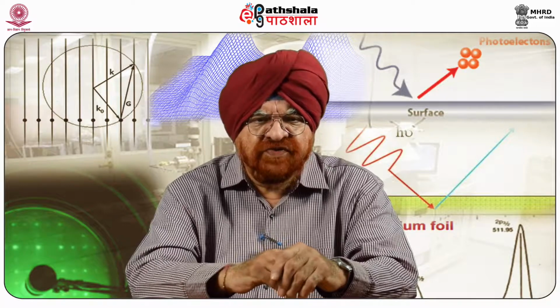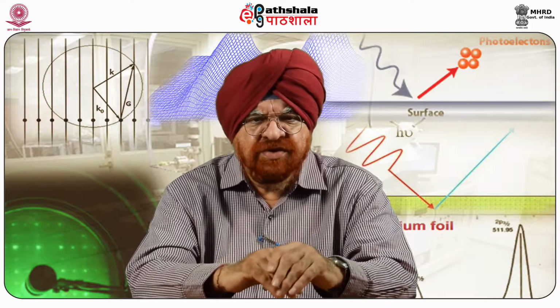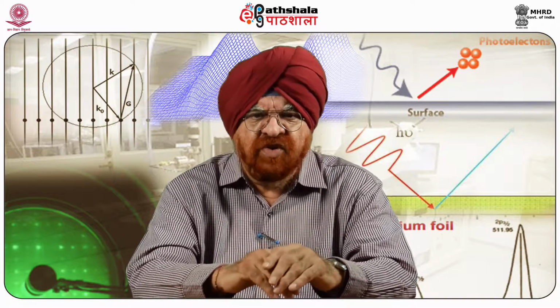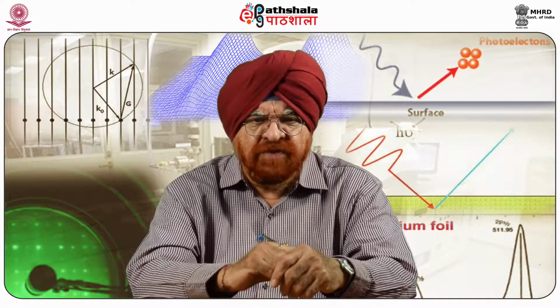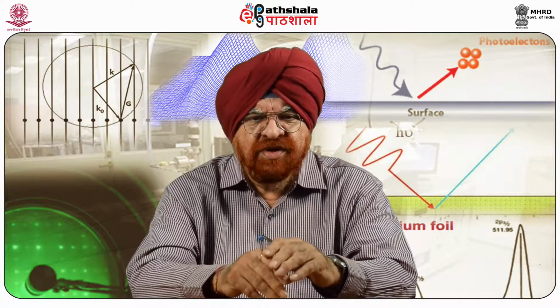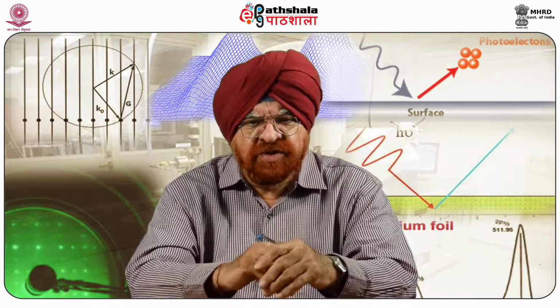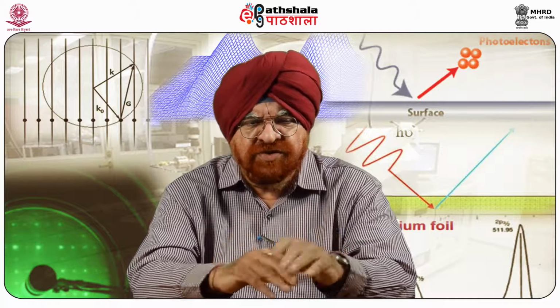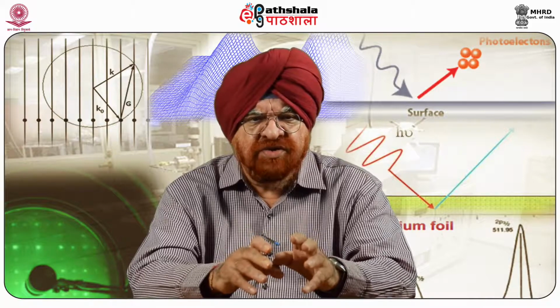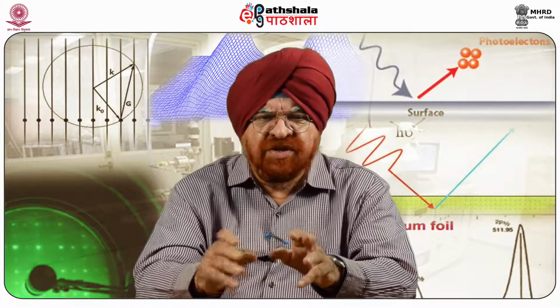The advantages of this MFM originate from several reasons, which include that the sample does not need to be electrically conductive, which is a major advantage. Measurements can be performed at ambient temperatures, in ultra high vacuum called UHV, in liquid environments also, at different temperatures as well, and of course in the presence of variable external magnetic fields. Measurement is non-destructive to the crystal lattice or structure. This is a very big advantage when we compare it with the other techniques.